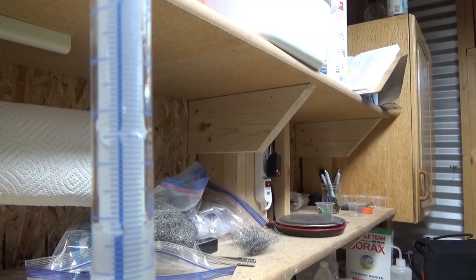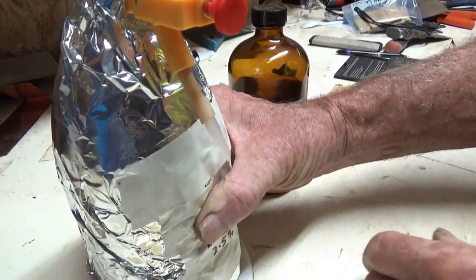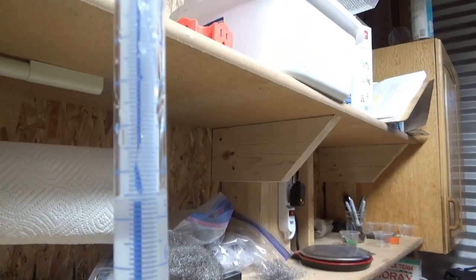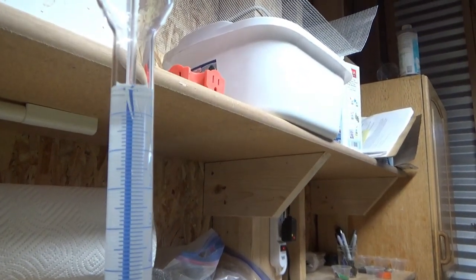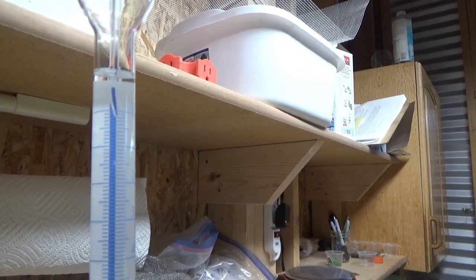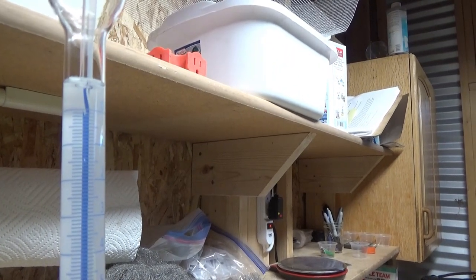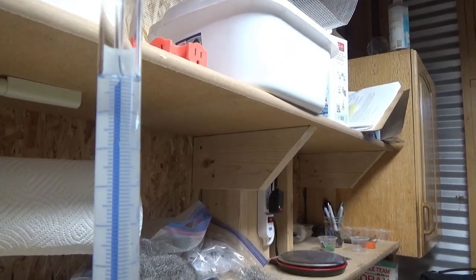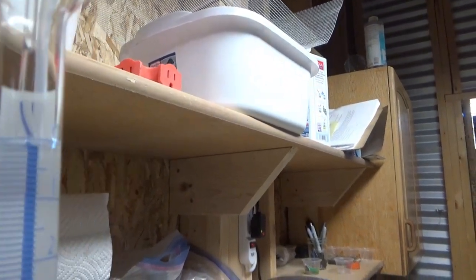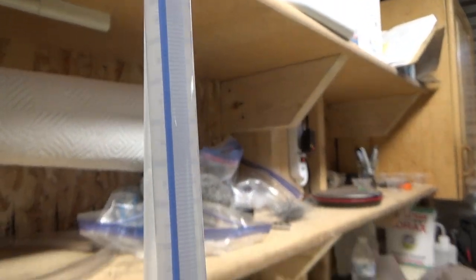Now in this case this is called an automatic burette, and if you look up here I'm going to squeeze the base, which has up to a liter of solution in it. Now I see it's got too much. Well, if you're doing this without an automatic burette, you then have to release a little bit and get it down there. With this, you just release and it sucks it right down to the zero line. I really like automatic burettes. It does make it easier.